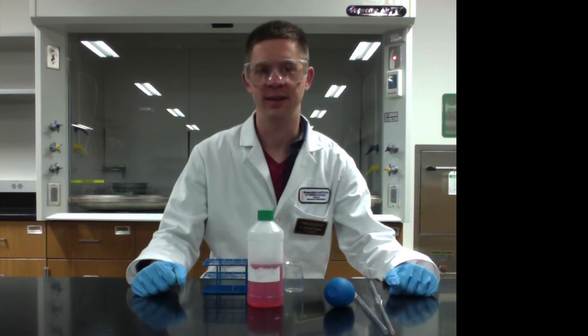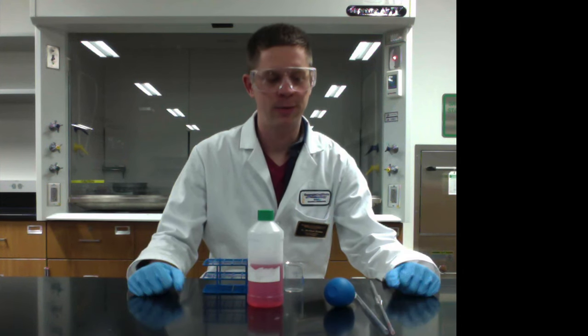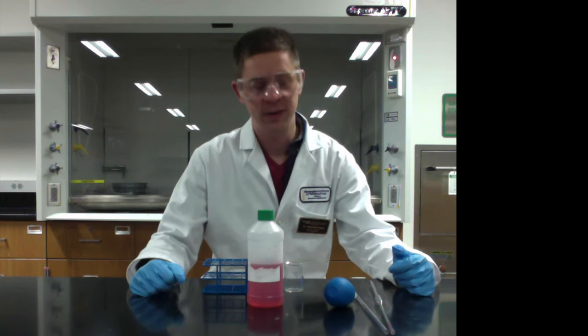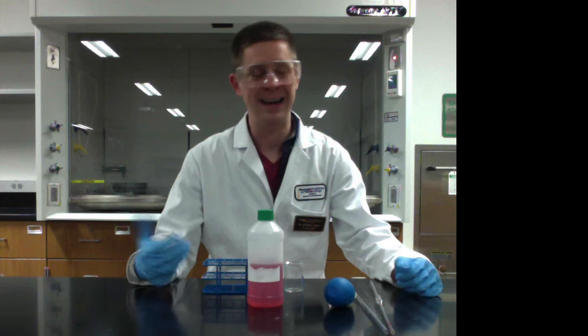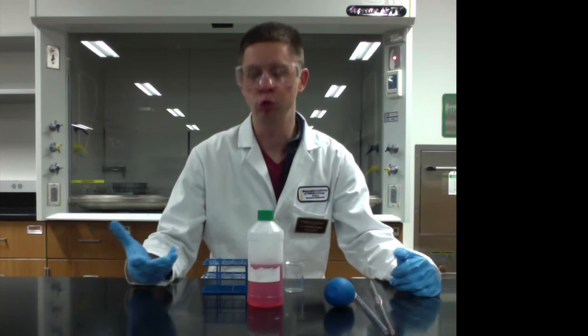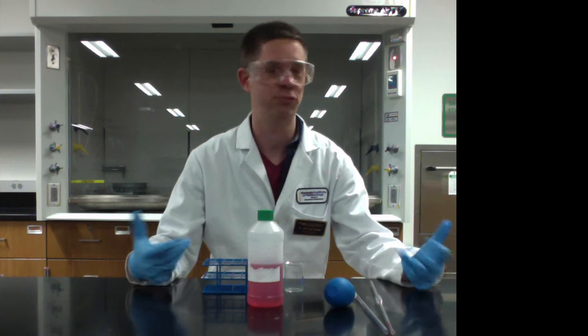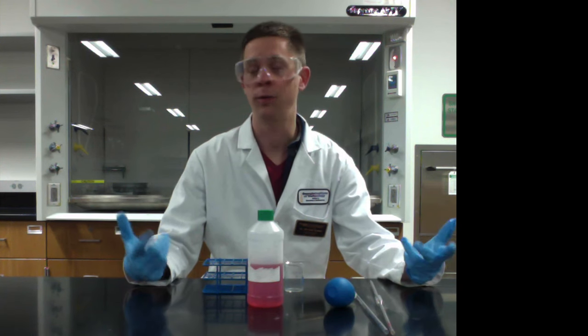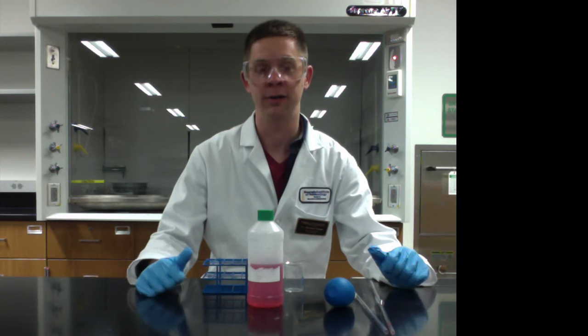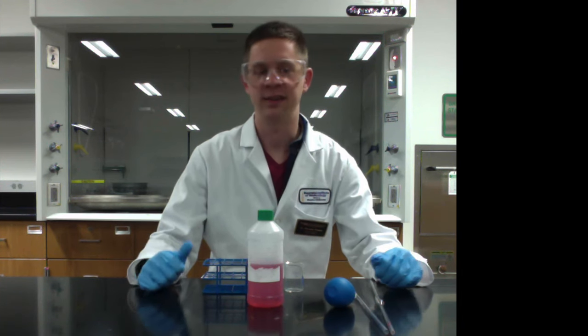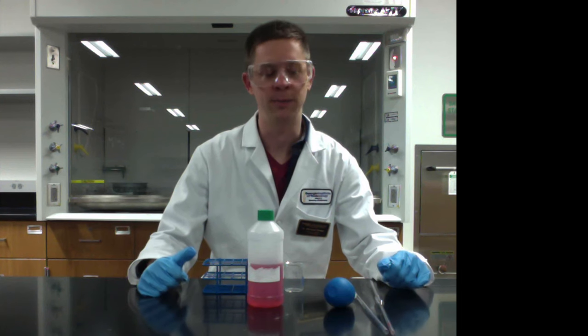Let's talk about proper pipetting technique. Pipetting in chemistry is so important. It's really impossible to understate the importance of pipetting in chemistry because the accurate measurement of solution volumes is essential in so many applications. Running reactions, performing analytical tests, all kinds of stuff like that. You don't want pipetting to be a barrier between you and success in chemistry. So let's talk about proper pipetting technique.